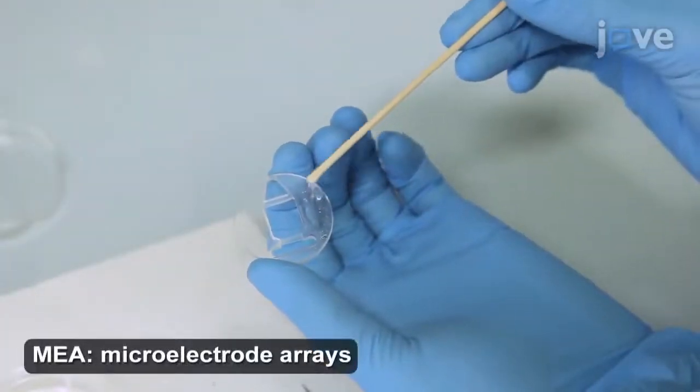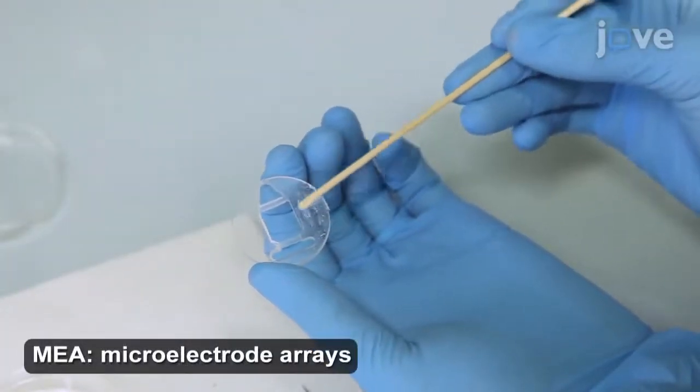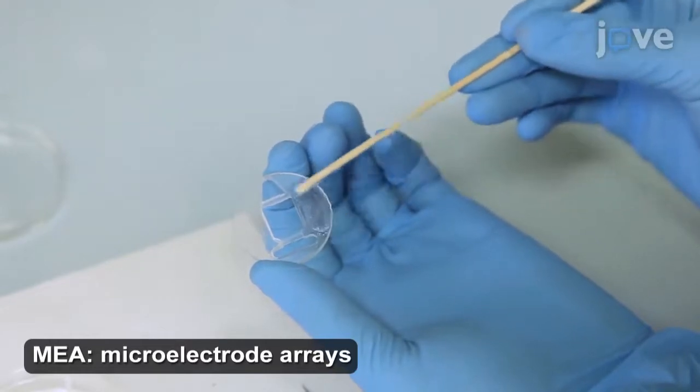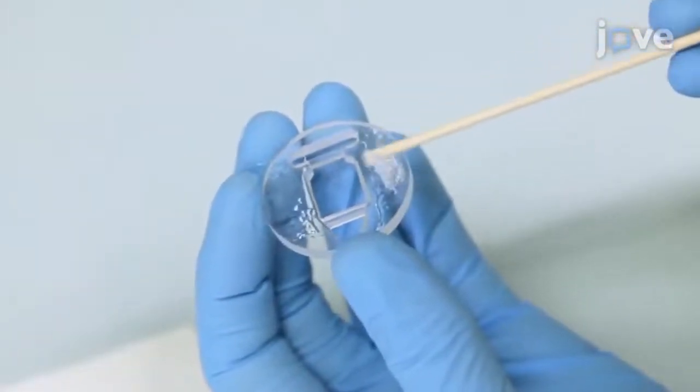To prepare the MEA, evenly spread the elastomeric sealant on the bottom surface of the recording chamber and make sure that there are no bubbles.